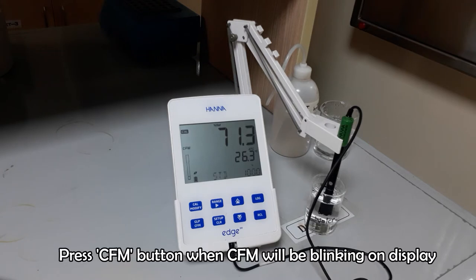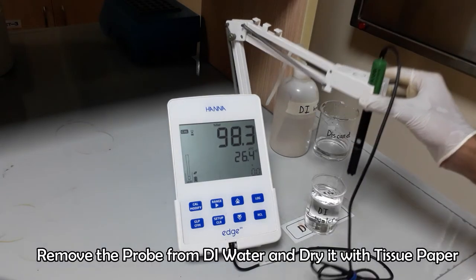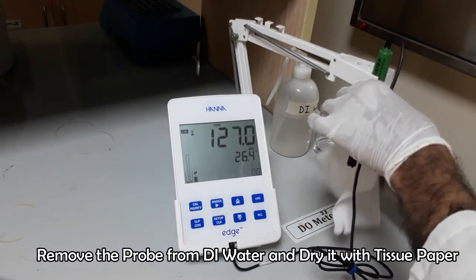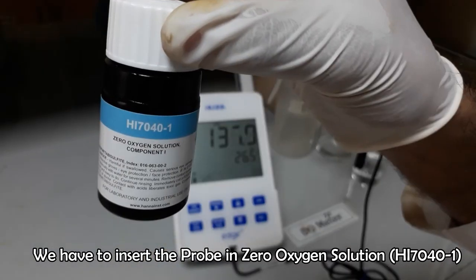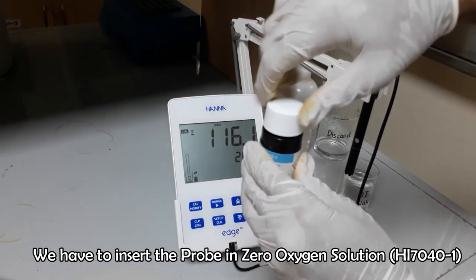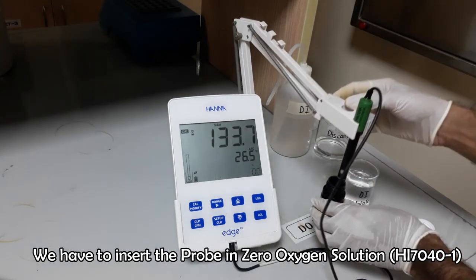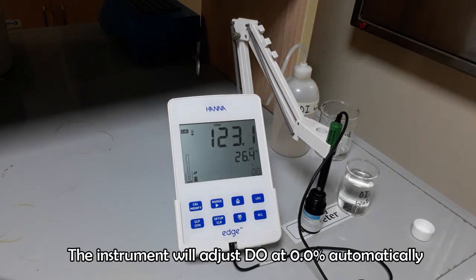When the CFM will blink on the display, press the CFM button quickly. Now remove the probe from DI water and insert it in zero dissolved oxygen solution as quick as possible. Wait some moments to see the blinking of CFM word on the display.